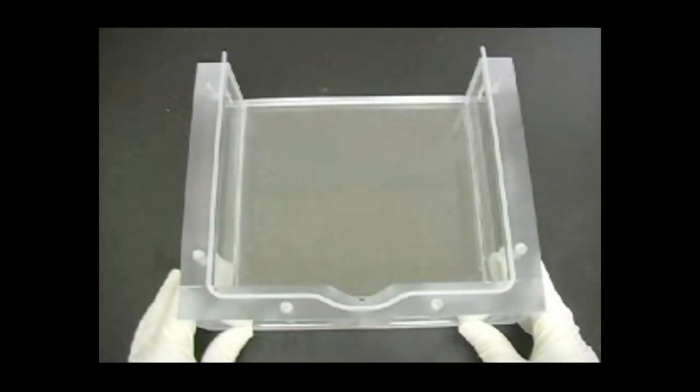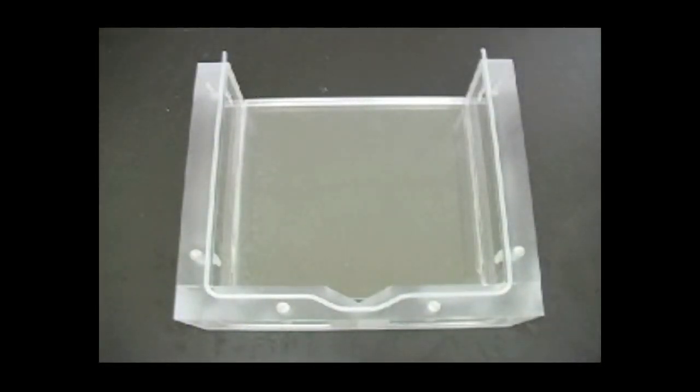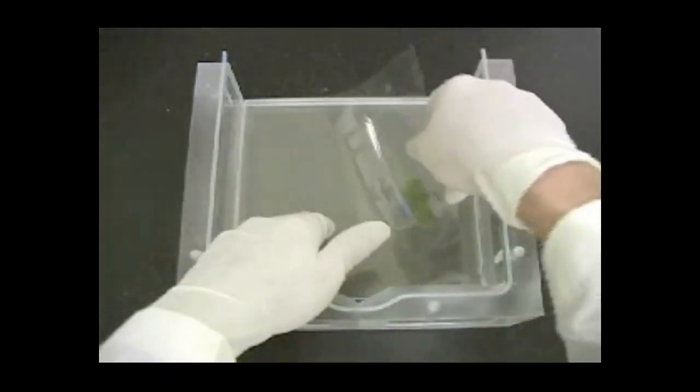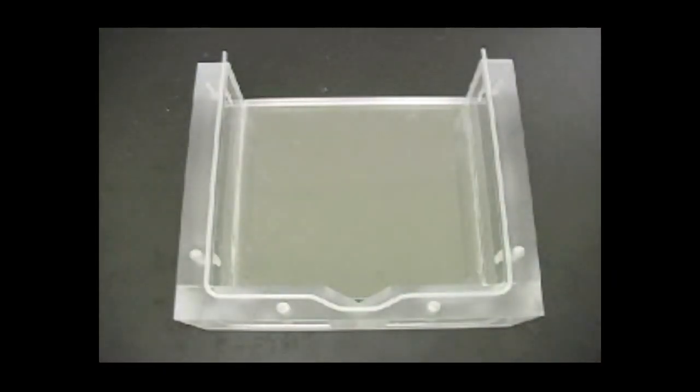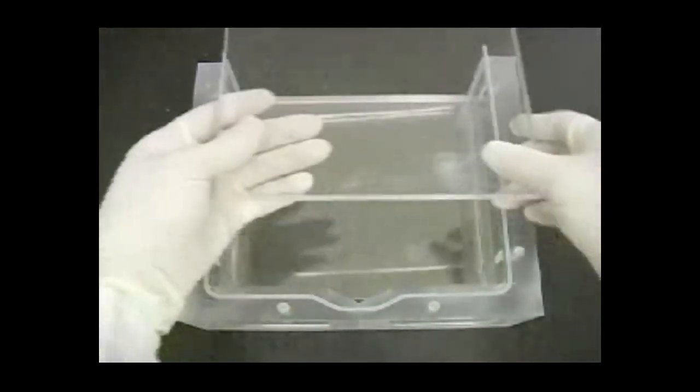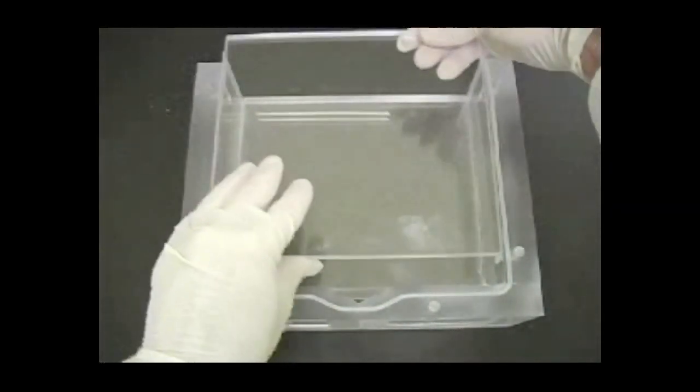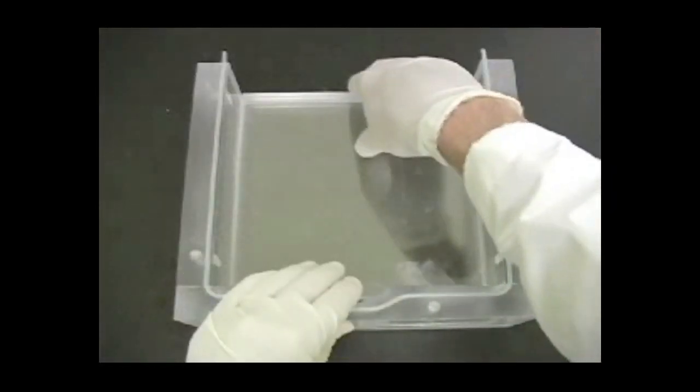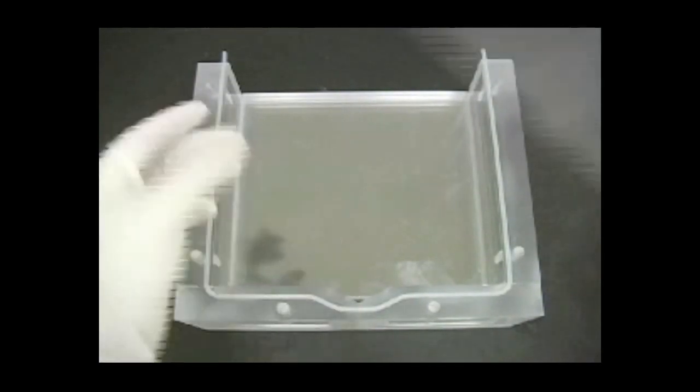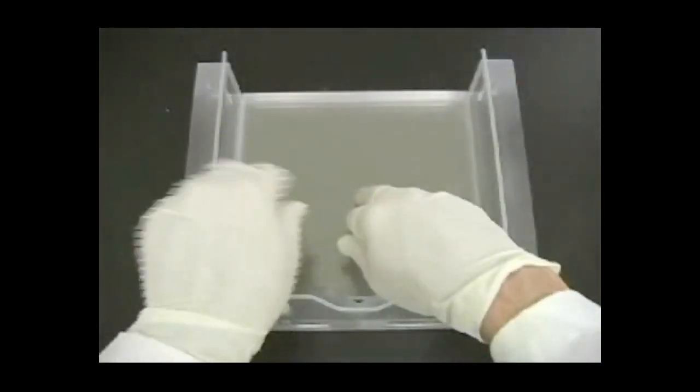Start by placing acrylic blocks into the chamber so that they seat at the bottom. Before placing your first Protein II XL glass plate, place a separation sheet on top of the acrylic block.